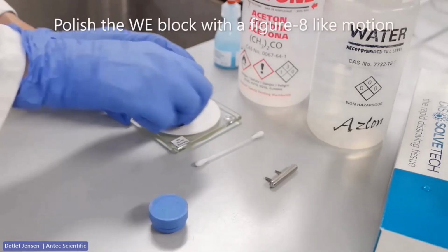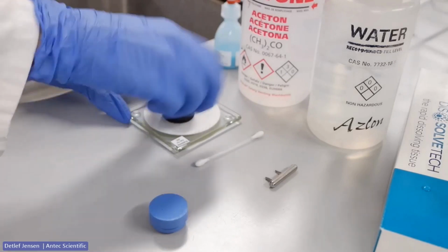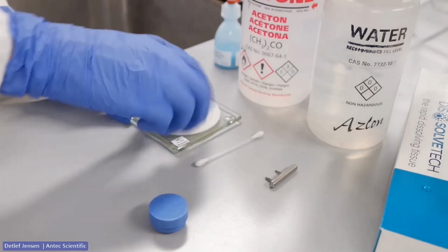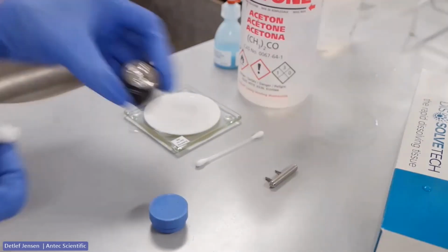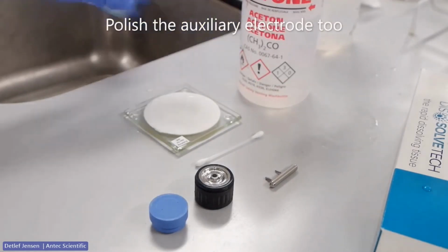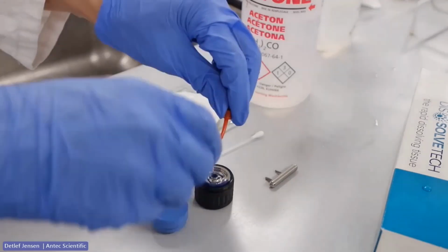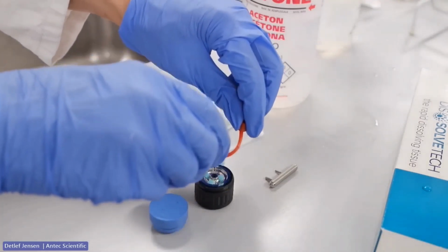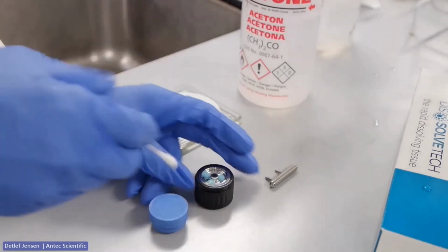Use a figure-8 motion. Well, any letter of the alphabet will do, but do it for about 1 minute. And polish the auxiliary electrode as well. Few dabs here. Take the cleaning pad.